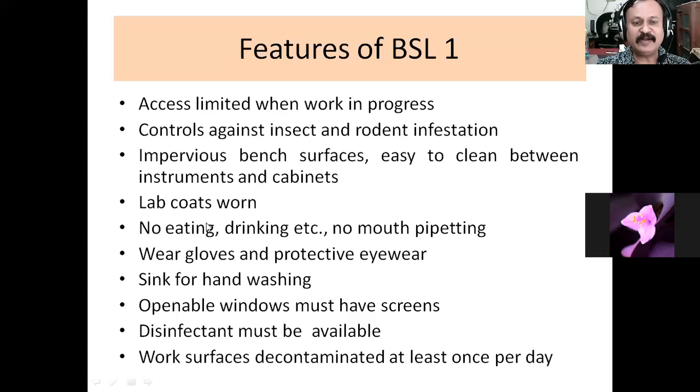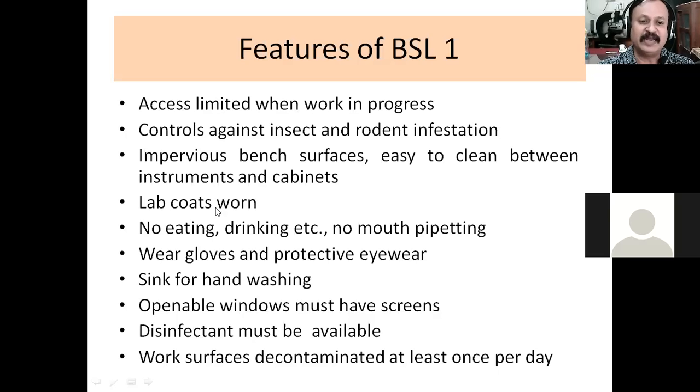So I was telling you that even if you haven't got ample opportunity to work in the laboratory, at least in the first year BSc, you have worked in your microbiology laboratory. And at that time, I believe that you might have worn your aprons, isn't it? Yes or no? Yes, sir. So you are wearing lab coats or aprons, and that is essentially required if you are working in a microbiology laboratory, even if it is a simple kind of setting where we have biosafety level 1 applied. You are supposed to wear the lab coats.